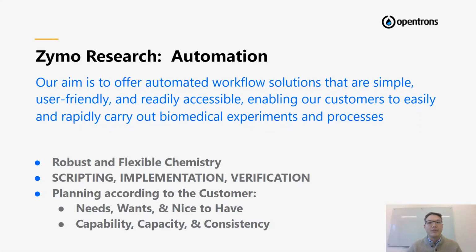And for us, we go through one more step. It can kind of be said that Carlos also does that with his group in terms of experiments, but because we are defining an assay kit, we go through a process called verification or validation.